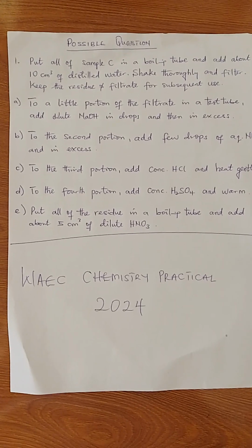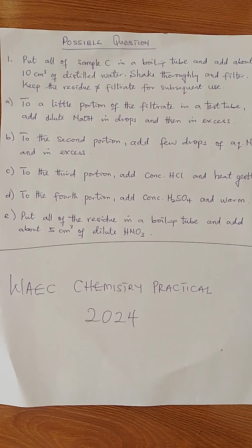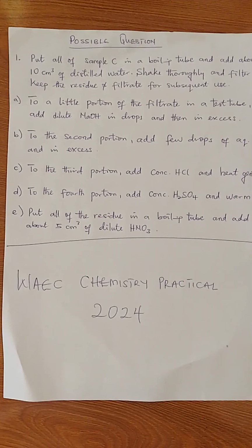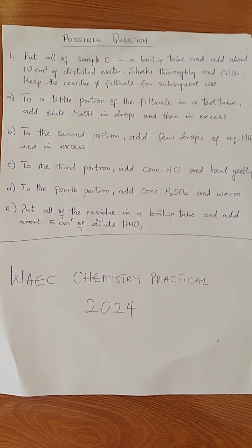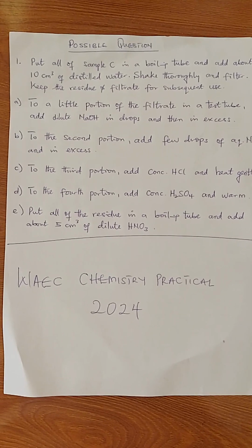The possible questions are: put all of sample C in a boiling tube and add about 10 cm³ of distilled water. Shake thoroughly and filter. Keep the residue and filtrate for subsequent use.